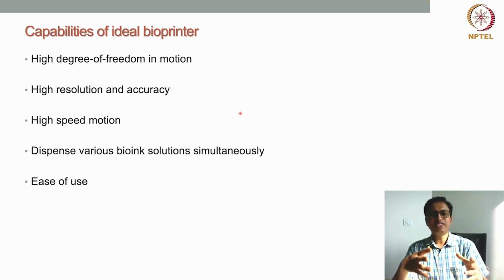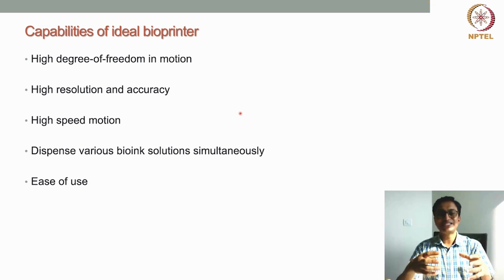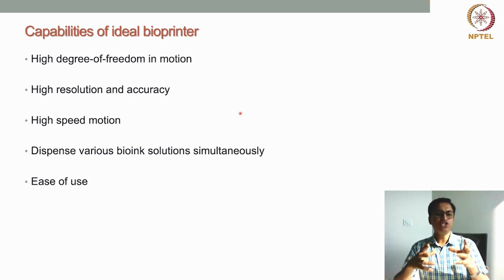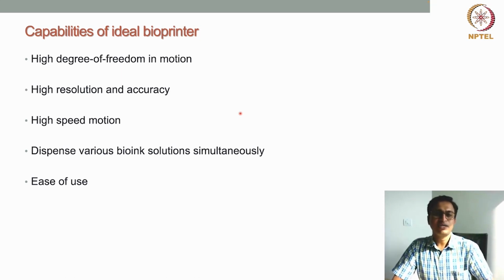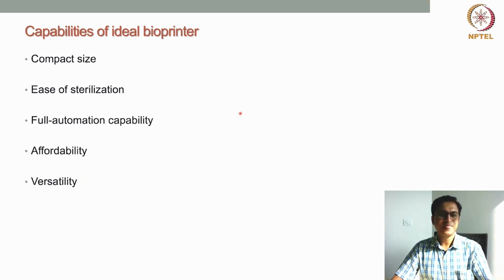So the bioprinter, if it has to be adapted, suppose there should be widespread use of bioprinters, then the ease of use is definitely a common requirement for easily translating this bioprinter for different applications. Other thing is the bioprinter should have compact size.